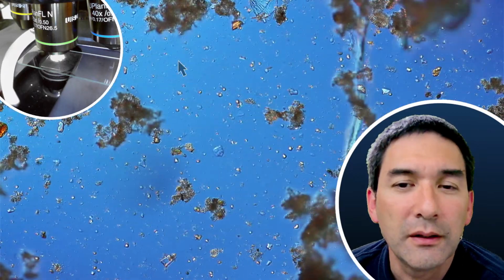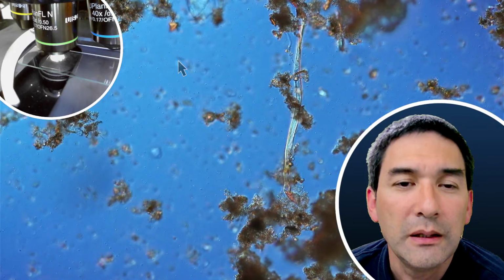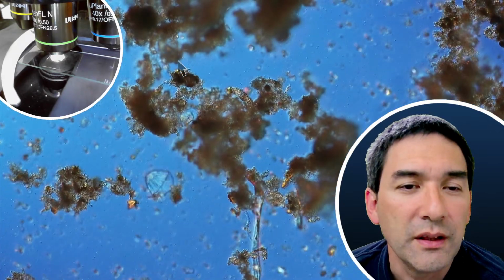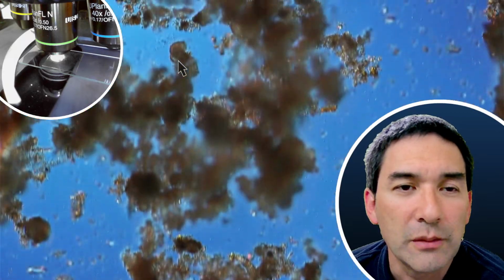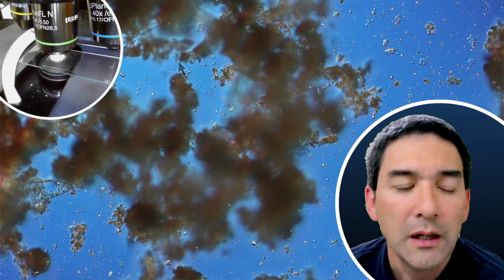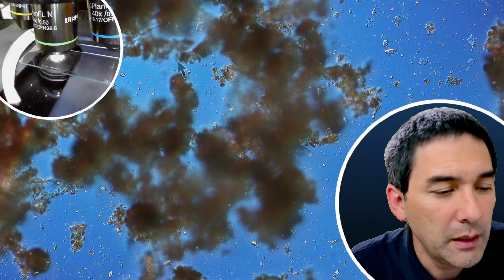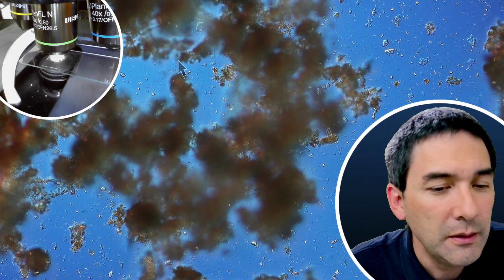And I have to tell you that today in the morning when I did this, I saw more interesting things, like algae, some green material as well. I do want to show you now very briefly a time-lapse video that I made.